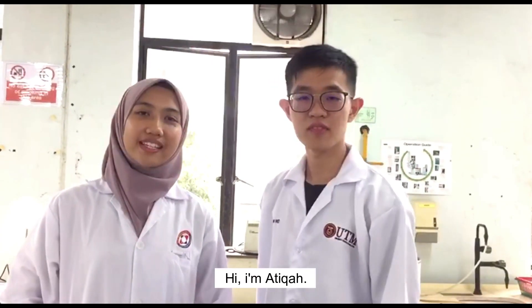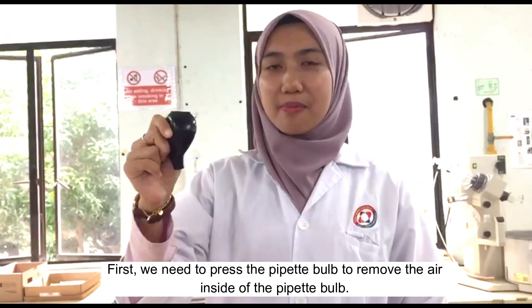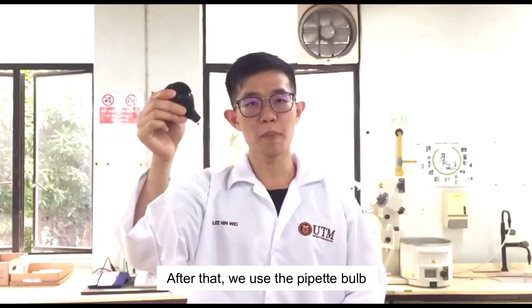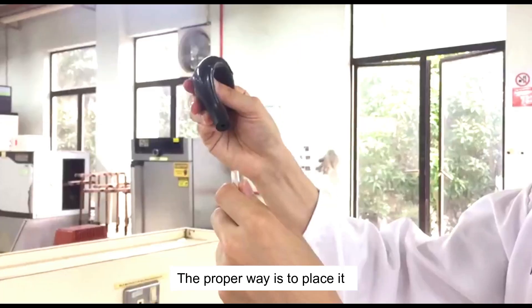I'm Linhue. Hi, I'm Annika. Today we will demonstrate how to use a pipette. First, we need to press the pipette bulb to remove the air inside it. After that, we will use the pipette bulb and place it on top of the pipette — not insert it.